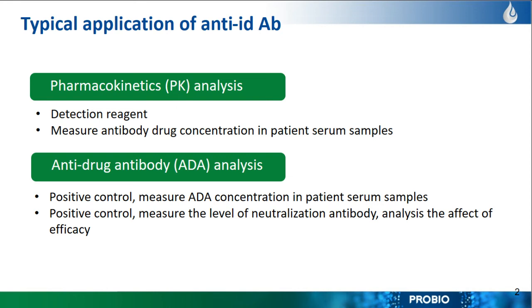How is PK achieved? Mass spec is widely used for the measurement of small molecule drugs. However, antibody drug is totally a different story. Human serum contains 5 to 10 mg per ml of IgG1, while the regular levels of antibody drug require sensitivity in the nanogram per ml range. Thus, this assay must be able to pick up the signal of antibody drug among a million-fold excess of signal.